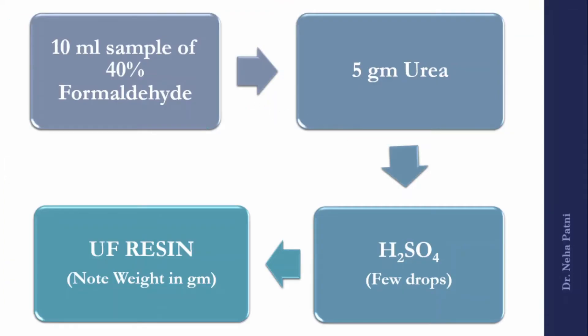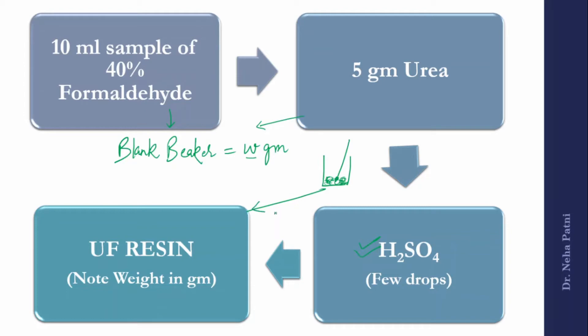To prepare urea formaldehyde resin: take a blank beaker and note its weight as W grams. Add 10 ml of formaldehyde solution to it. Then measure 5 grams of urea on the weighing balance and add it to the beaker. Stir with a stirring rod until the urea dissolves completely in the formaldehyde. At that point, add a few drops of concentrated H₂SO₄. This will cause solidification very soon, and you will be ready with your UF resin.